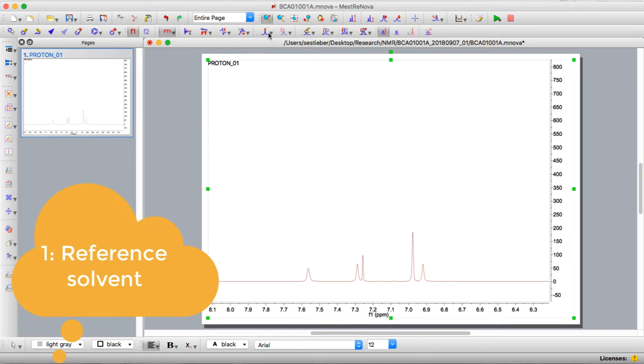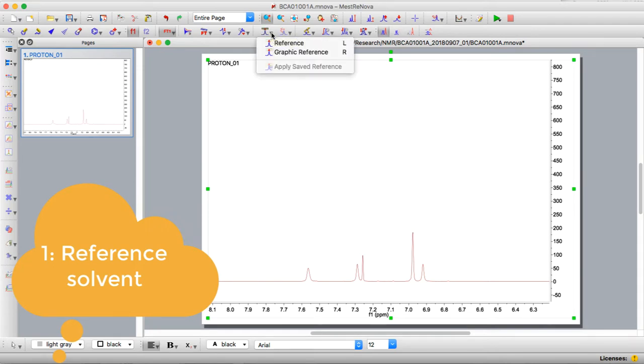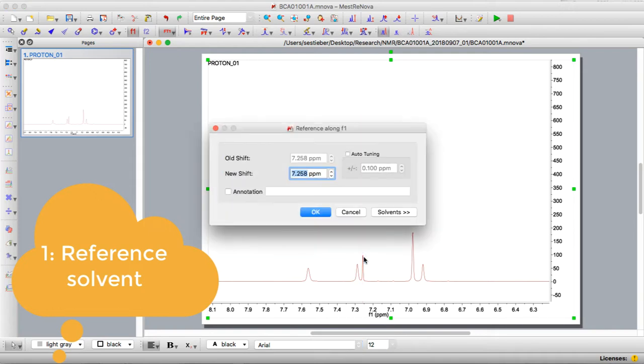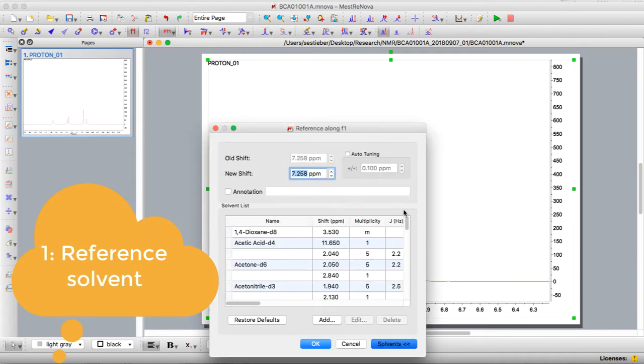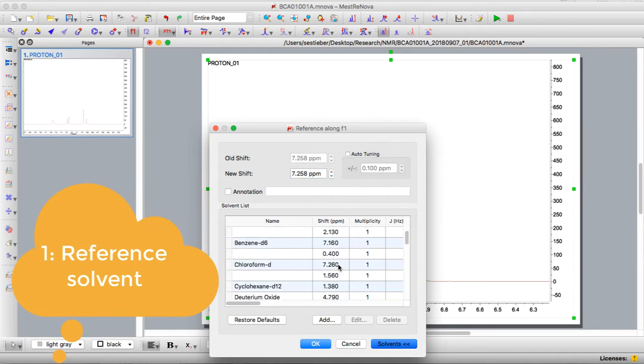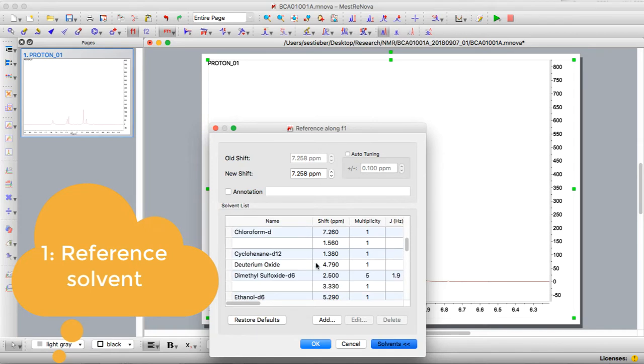Once I've zoomed in on that region, I select the reference button up here, which has the little ruler over it, and then it lets me hover over peaks and click to it. I'm going to select the one that's chloroform, and then I will click on solvents. If you scroll down you can see it gives you the shifts of all the different solvents. In this case chloroform-D 7.26, and then I say okay.